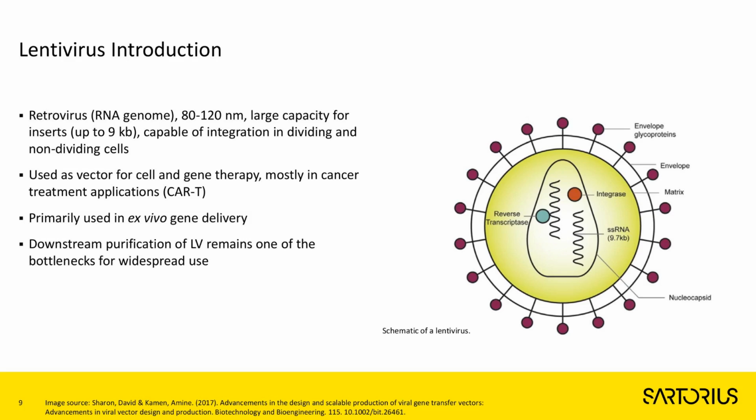Currently, it is mostly used in cancer treatment applications, primarily as an ex vivo gene delivery vector. The downstream purification of lentivirus, however, still remains one of the bottlenecks for its more widespread use.